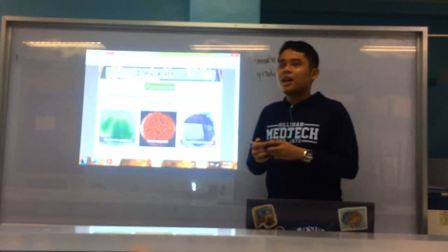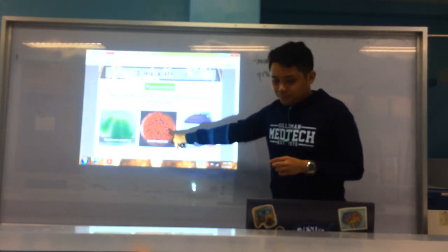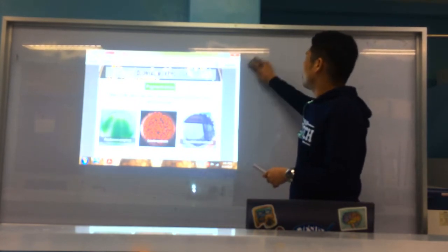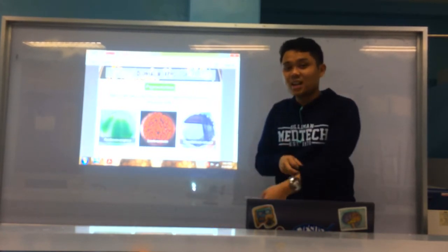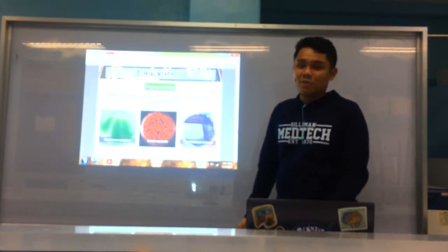I think it produces it at room temperature, but I'm not certain, I forgot. That gives the red color to Serratia marcescens. Very characteristic: if in a non-differential medium like nutrient agar there is red discoloration, that could be Serratia marcescens. Very good.